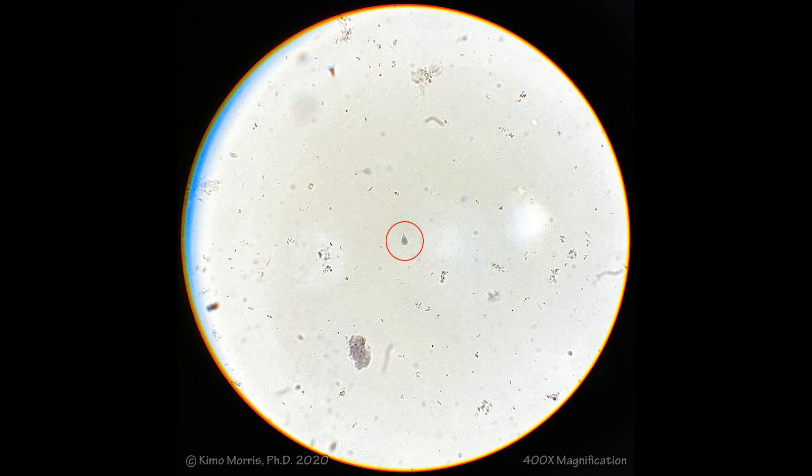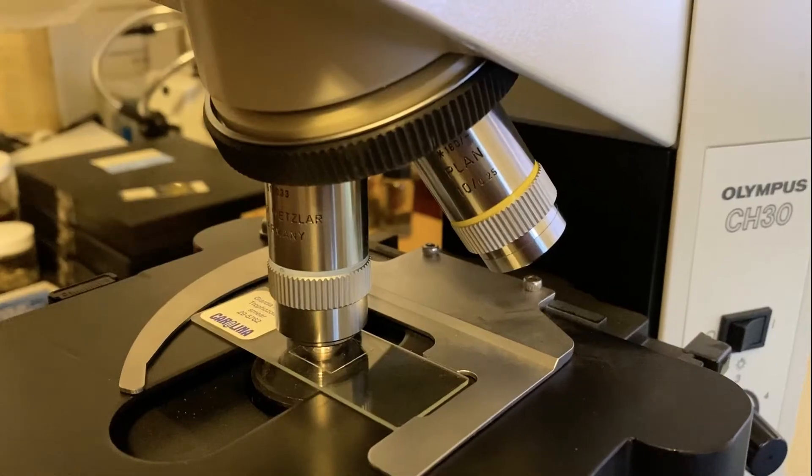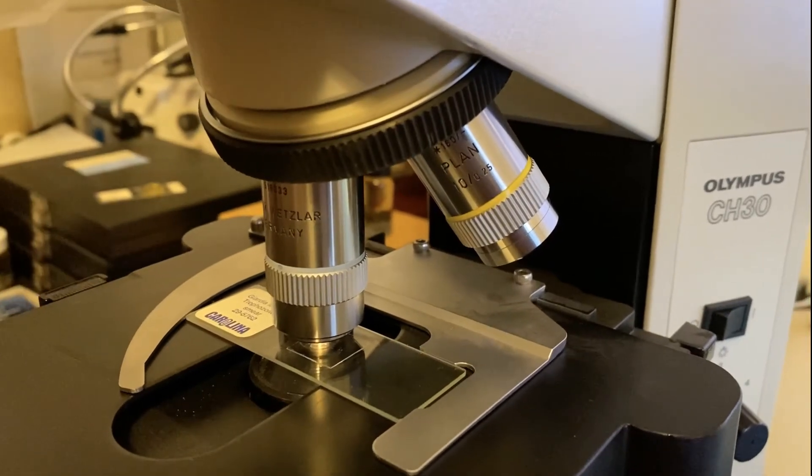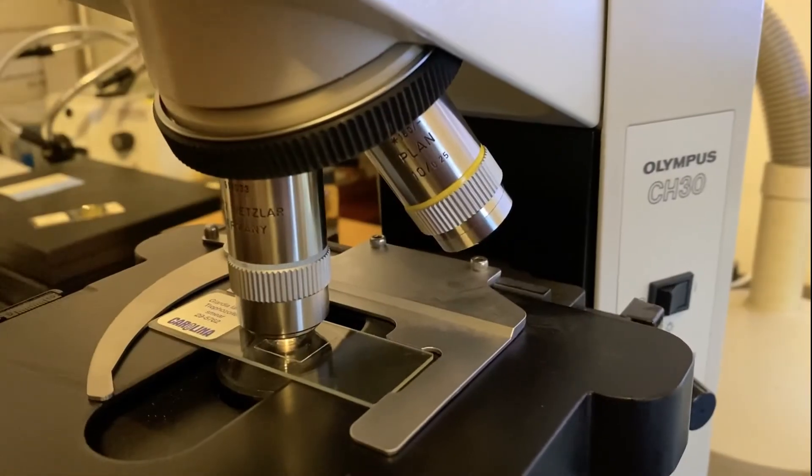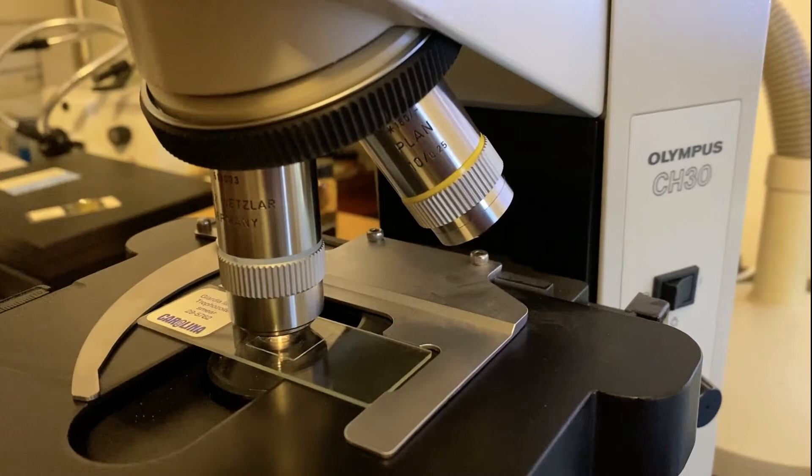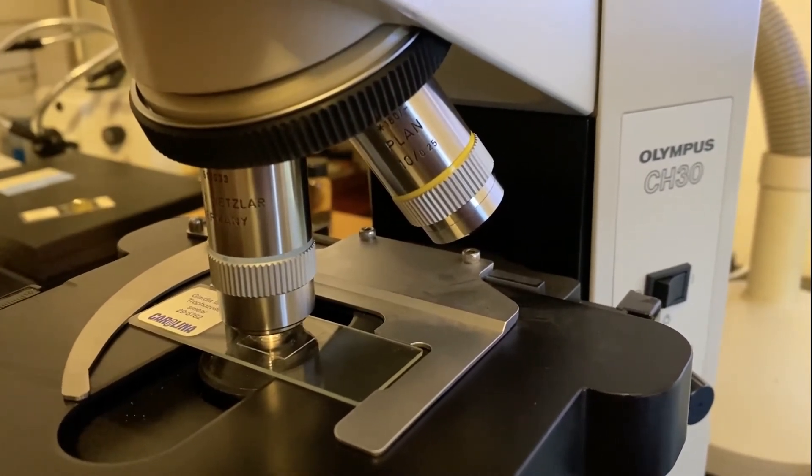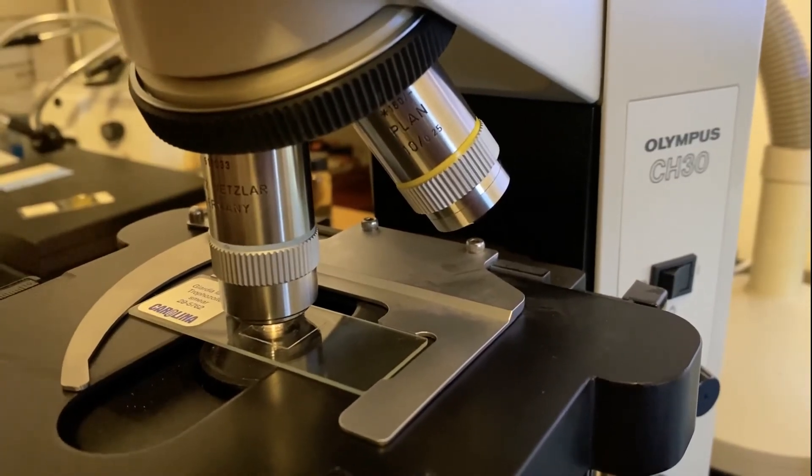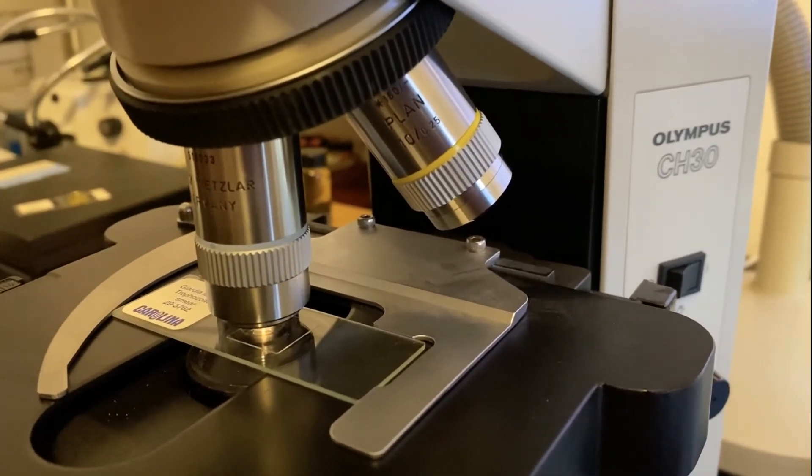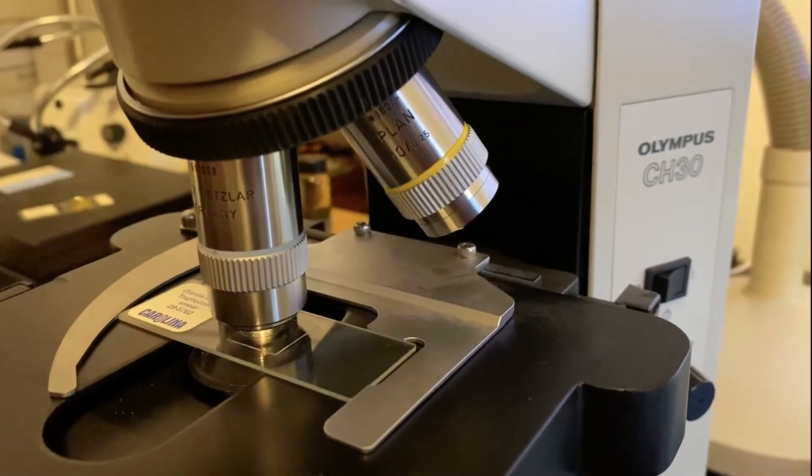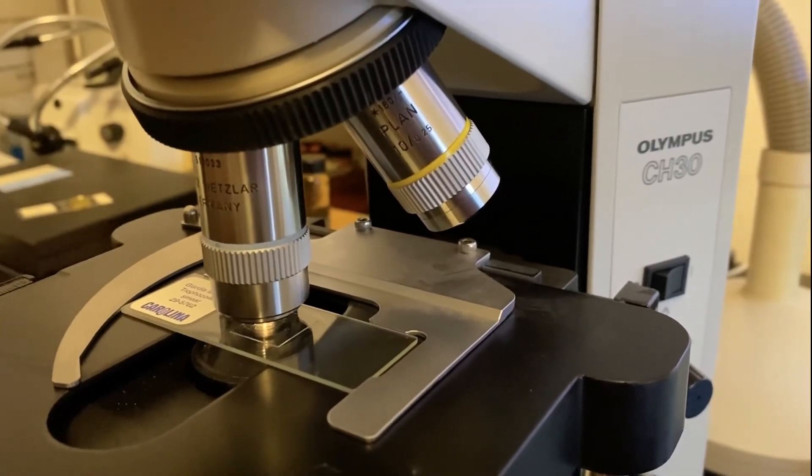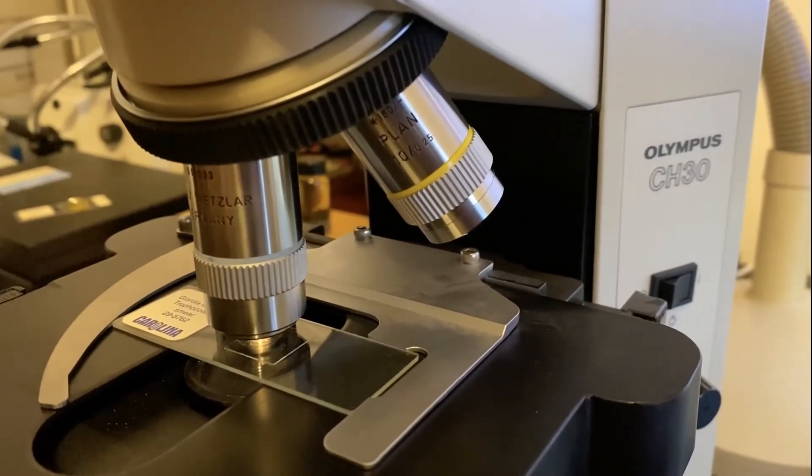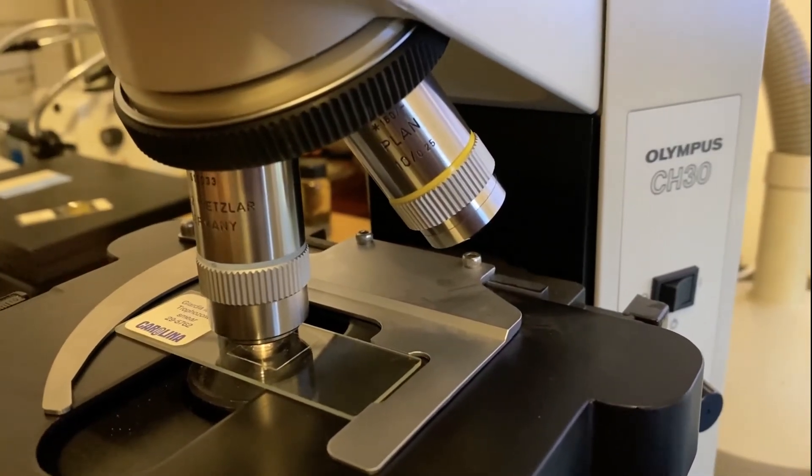So here is where the oil immersion comes in. Under this current magnification, we're pretty close to the limit of what we can see. If there is an air space between the lens and the slide, if we're going to go to a higher magnification, we actually have to place oil in the way of the lens and the slide so that we can essentially move the air out of the space.